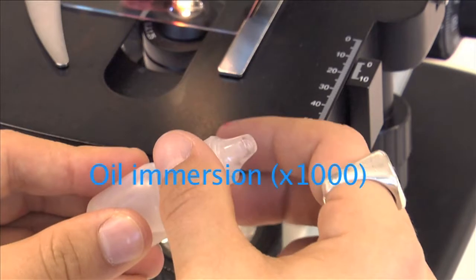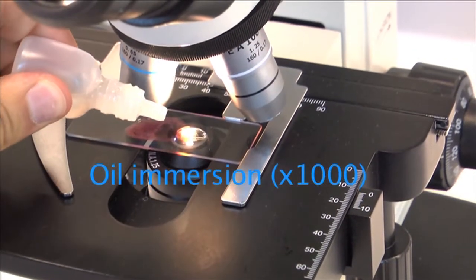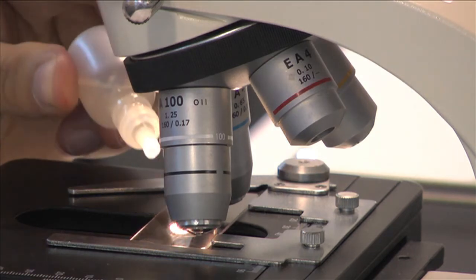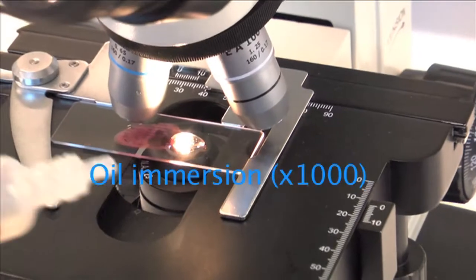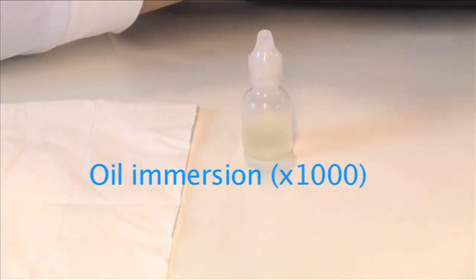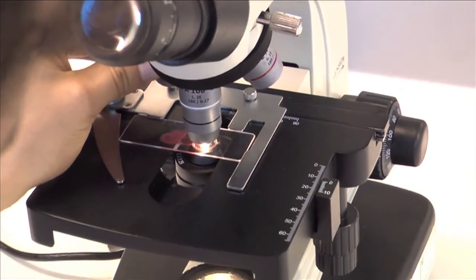The fourth lens — the one with the black stripe — is for oil immersion. This is the only lens designed for immersion in oil. Place a small drop of oil onto the slide, and slowly move the oil immersion lens into place. Both lens and slide should be in contact with the oil.